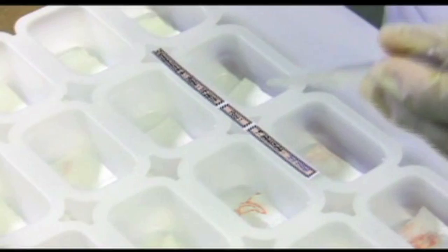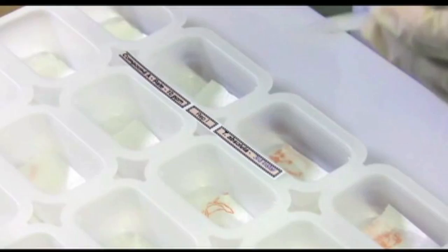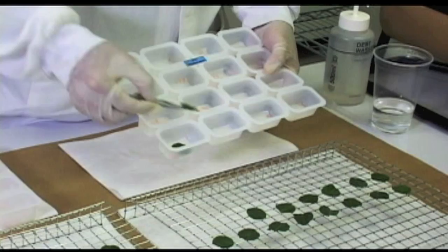In each tray cell, wet the paper towel to ensure that the leaf disc will not wilt and will remain in good condition for the duration of the bioassay. Remove any excess water from each tray cell. Place the leaf discs in the cells, making sure each disc goes into a properly labeled cell.